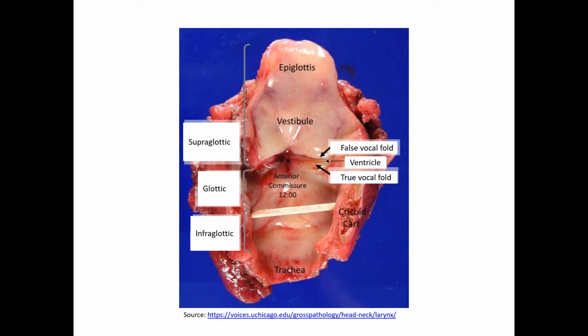Right. So sectioning, sampling correctly, and knowing all the anatomy and knowing which structures are important is pretty critical to sign out, as with any specimen. Oh yes, absolutely. If you could choose one section, what would you say is the most critical?